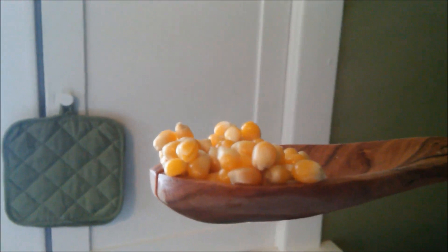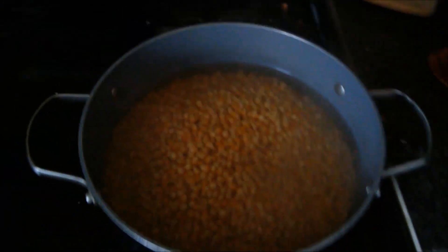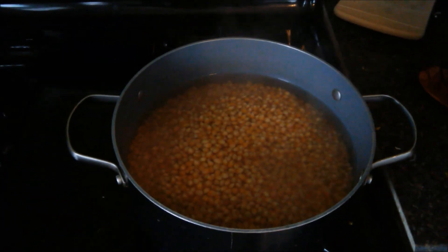The corn has been cracked. Now that the corn has been cracked, we are just going to turn off the heat and strain this out.